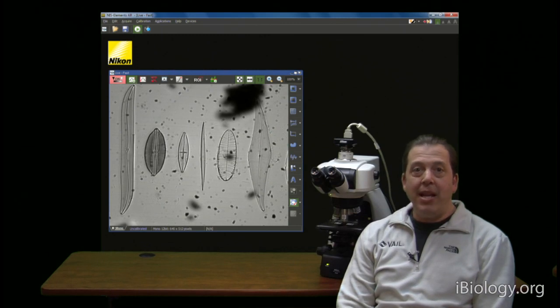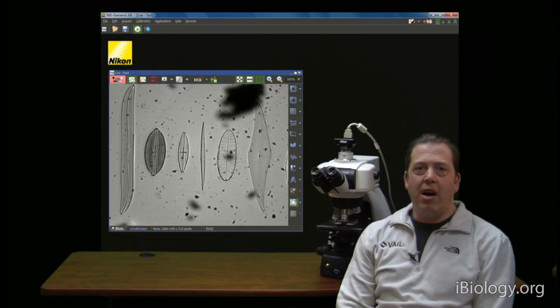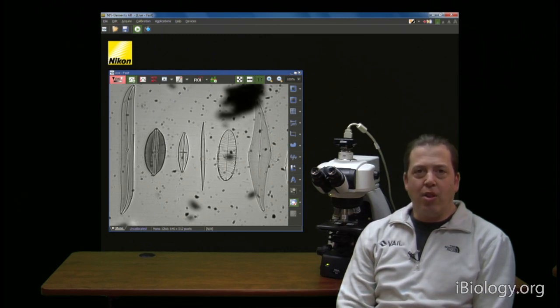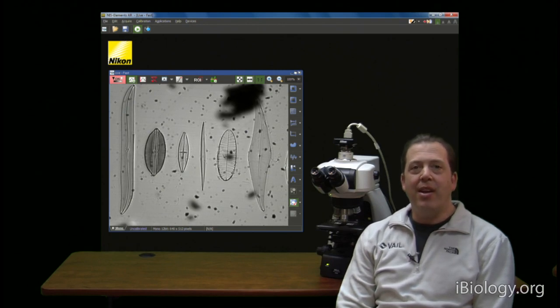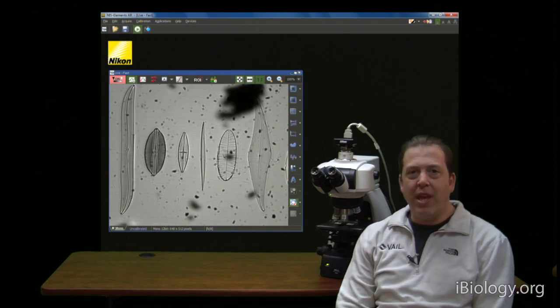Like many of the longer tutorials, a lot of it has to do with taking advantage of your knowledge of the image planes in the microscope.